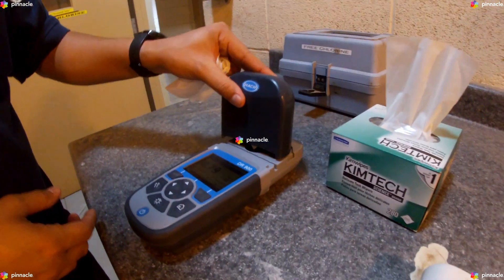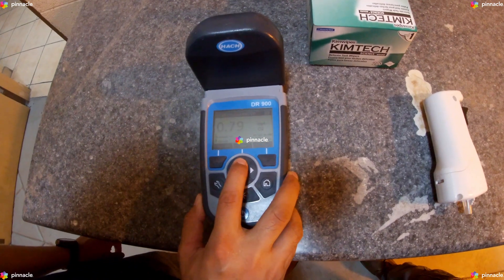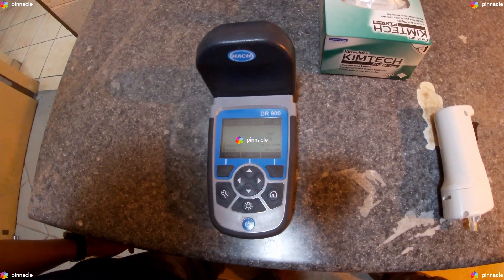On the DR900, we will press 0. The display shows 0.00 milligrams per liter.